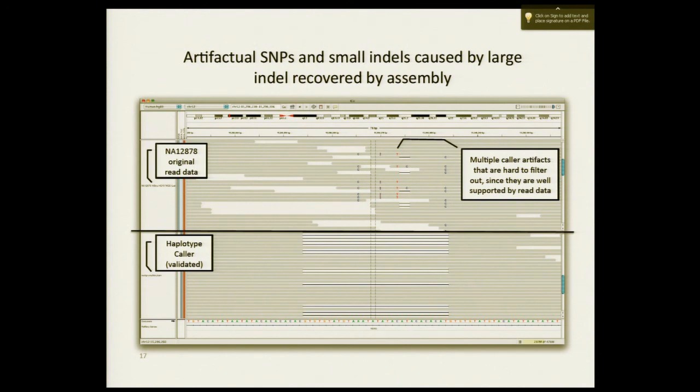What's up? Does it generate the BAM files again, obtain it now? Yeah, unfortunately it doesn't. Everyone asked me for this. I guess I'm going to have to work on this because everyone asked for it. The question is, so I'm showing you here a BAM file with the new indel. And so the question is, does the haplotype caller produce that BAM file or not? The answer is right now it doesn't. It produces a VCF file with this deletion in it.